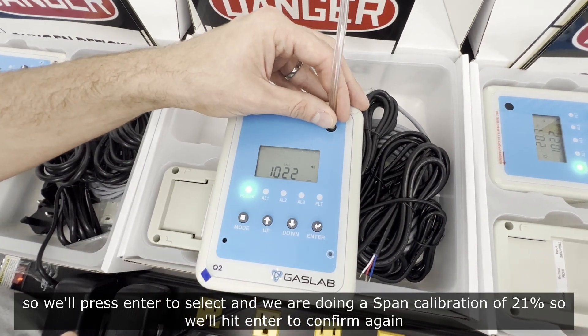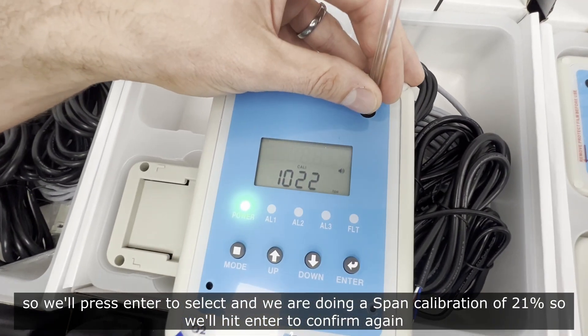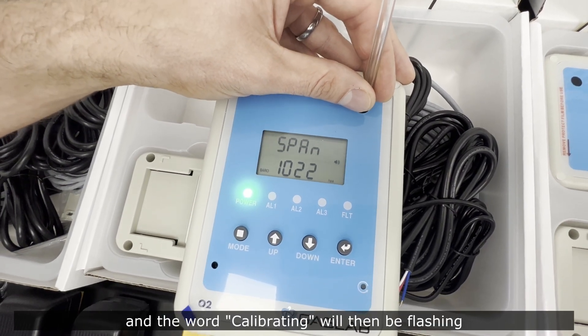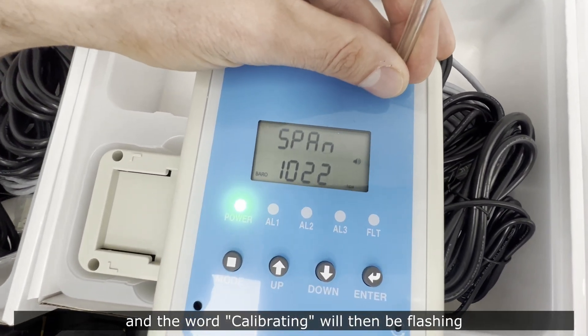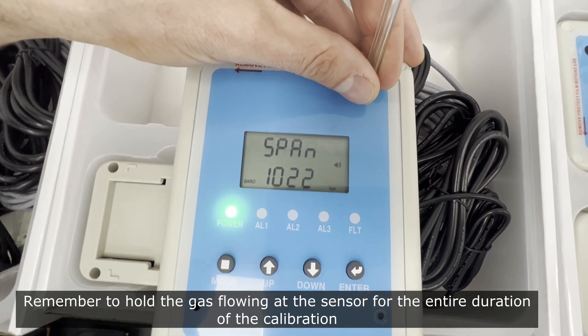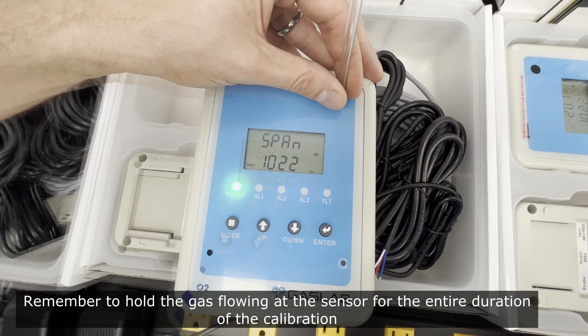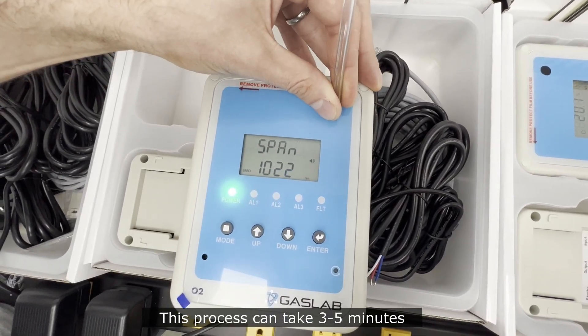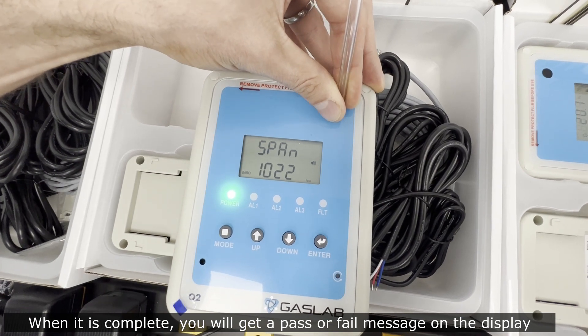Press enter to select, then confirm you're doing a span calibration of 21% by pressing enter again. The word 'calibrating' will then be flashing on the display. Remember to keep the gas flowing at the sensor through the entire duration of the calibration. This process can take three to five minutes, and when complete you'll get a pass or fail message on the display.